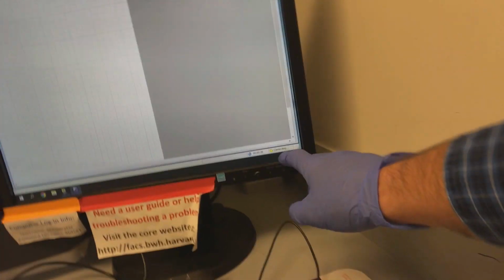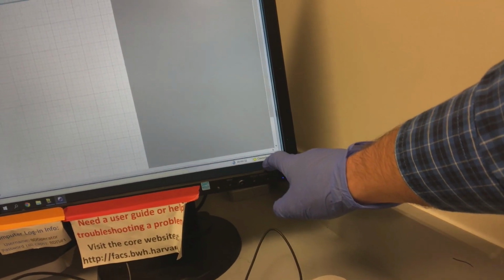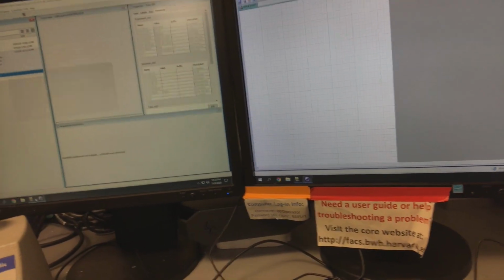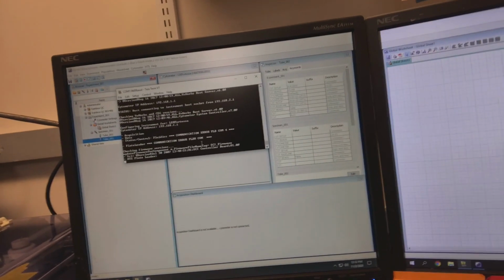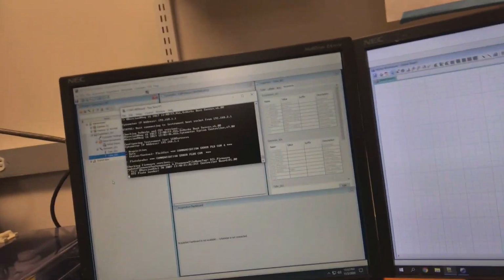Now the software will take a few minutes to connect, which you can see down in the right-hand corner. And you can also monitor the connection in TeraTerm to make sure that there's communication going on. Once it's done booting up, you'll have access to control the software.